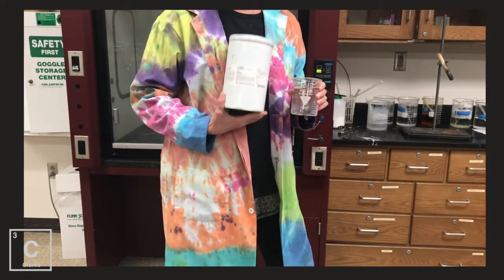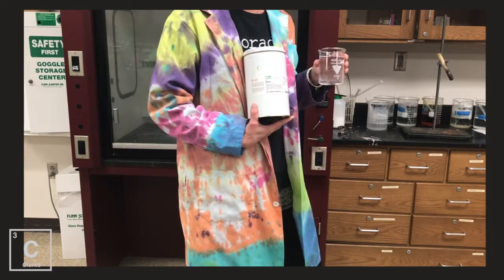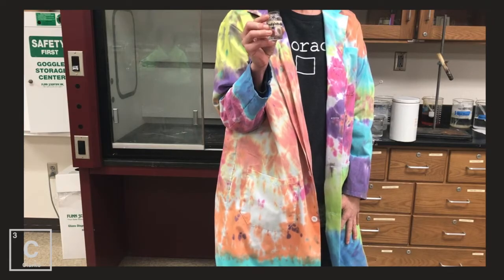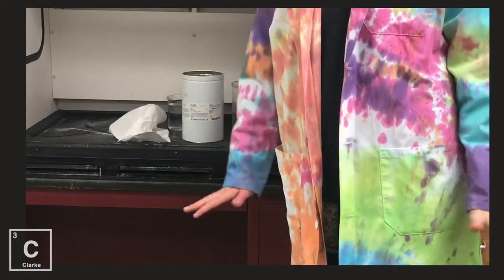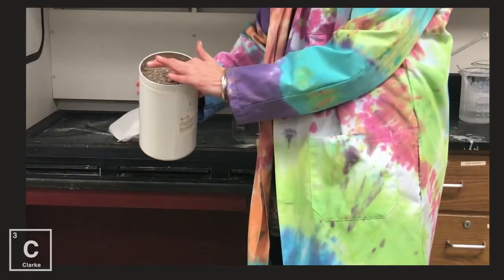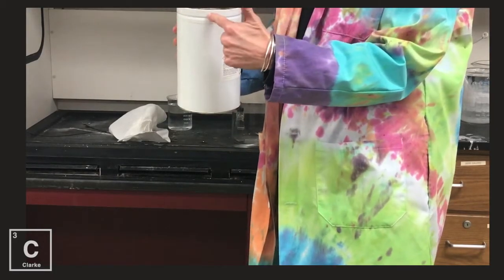For this reaction, we're going to react sodium — sodium metal, an alkali metal right from the periodic table — with water. To figure out what the products are going to be, I'm going to use an indicator: phenolphthalein. Phenolphthalein detects a base. Bases are any compounds that end with hydroxide, OH. Sodium is an alkali metal — very, very reactive. It's so reactive we have to store it very carefully, in a container with desiccant material that absorbs moisture, because sodium reacts very violently with water.